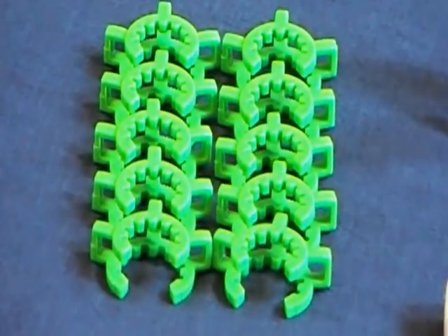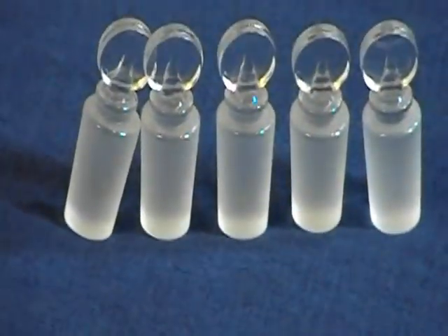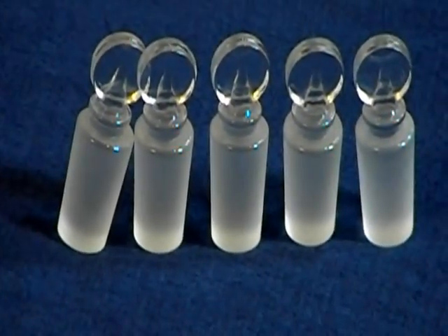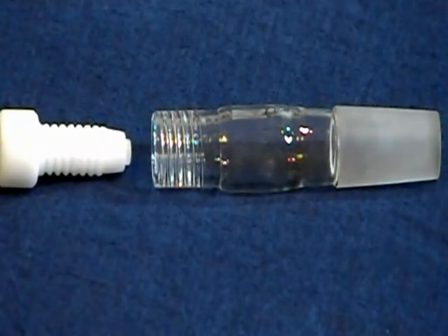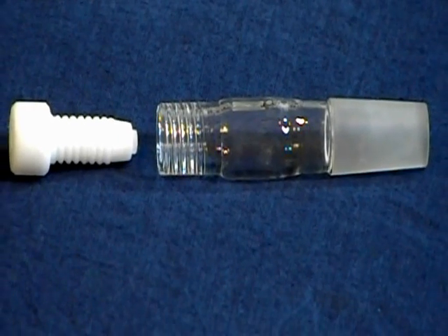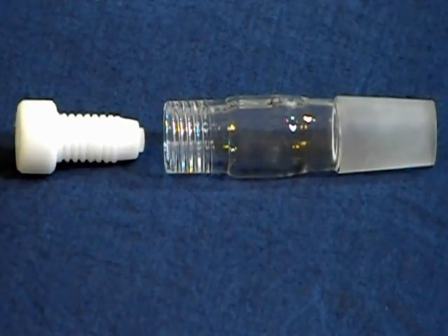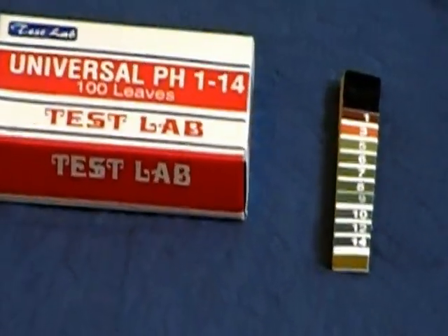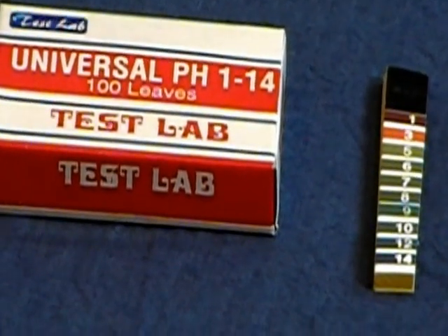Ten plastic Keck clips, 24/40. Five solid penny head stoppers, 24/40. One thermometer adapter, 24/40, with a nylon bushing for thermometer insertion and neoprene O-ring. One hundred pH strips that test from 1 to 14 on the pH scale.